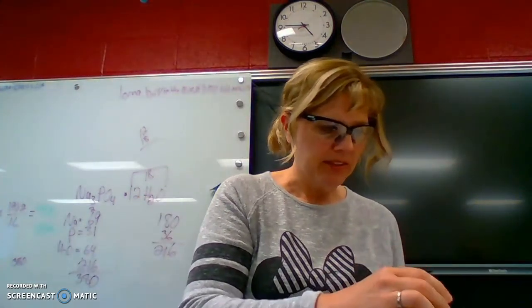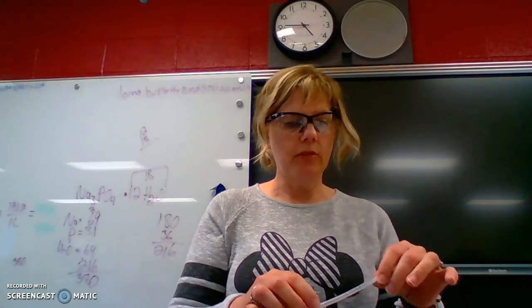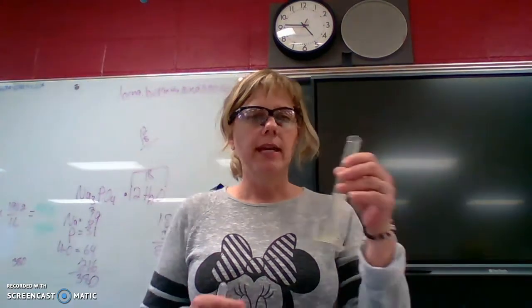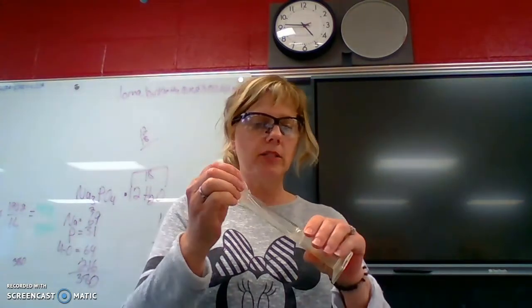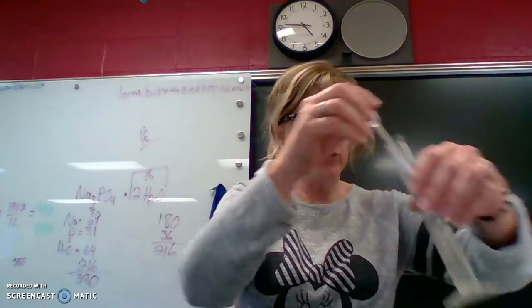There we go. I feel like that's perfect. And then I have kind of a damaged pipette, I don't remember why I cut the tip of this one off, but I think I'll get a clean one here really quickly. Okay, and I don't have this labeled because I just mixed it up for you all. 0.5 molar sodium phosphate. And it says to add 25 drops.